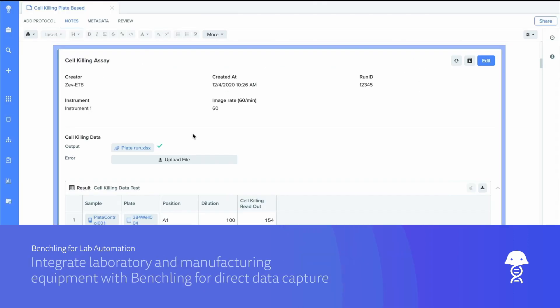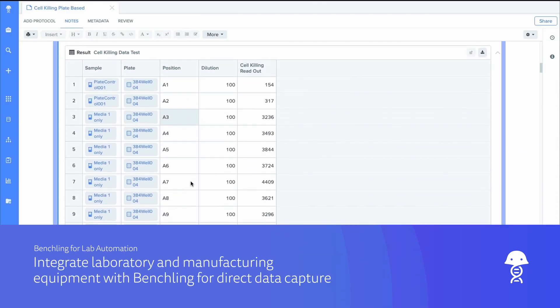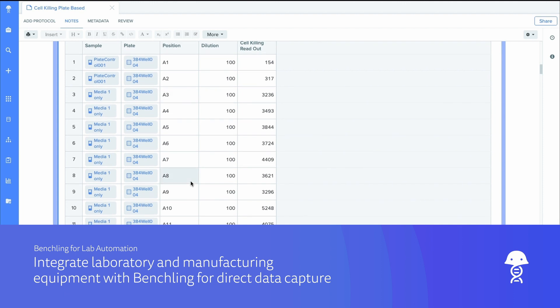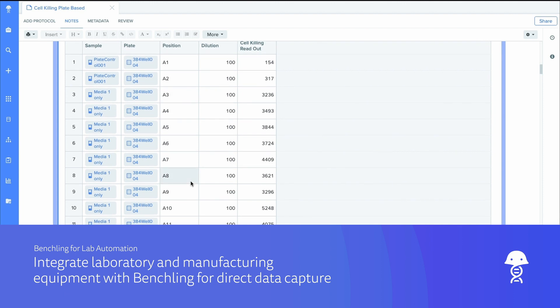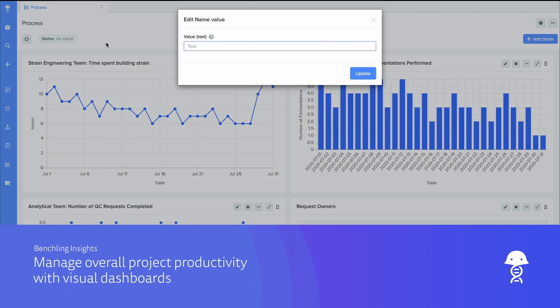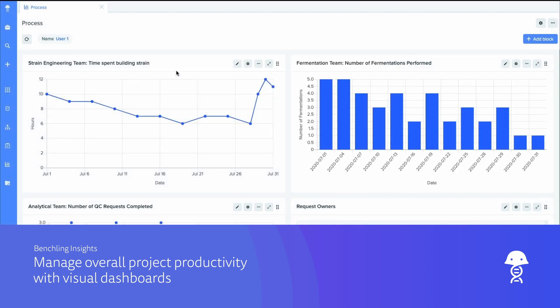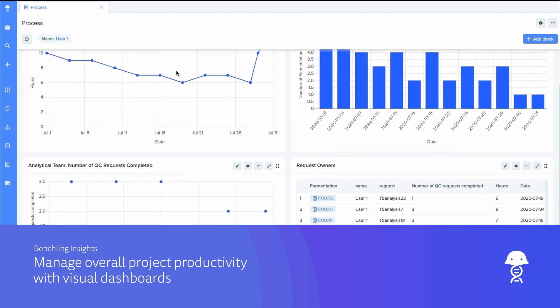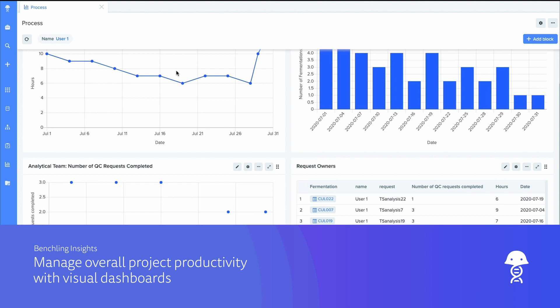Automate assay data collection by integrating manufacturing equipment with Benchling for lab automation. And create visual dashboards to track entire projects, from cell factory chassis to substrates to final products, and identify bottlenecks with insights.